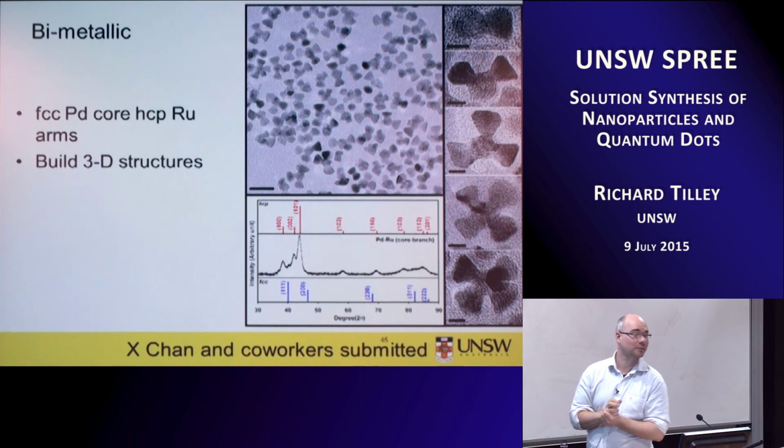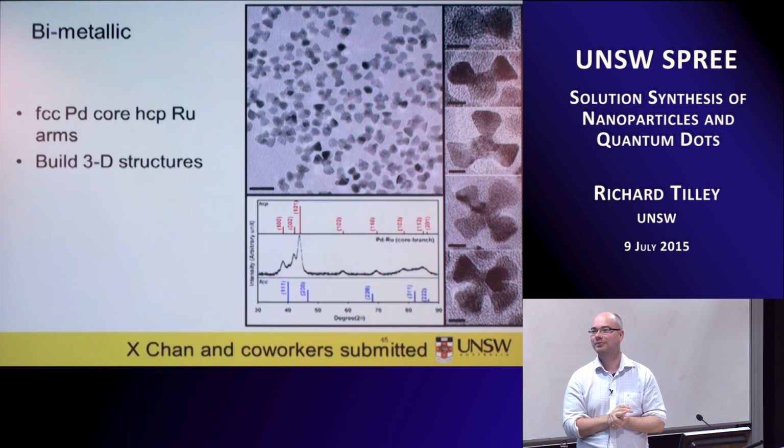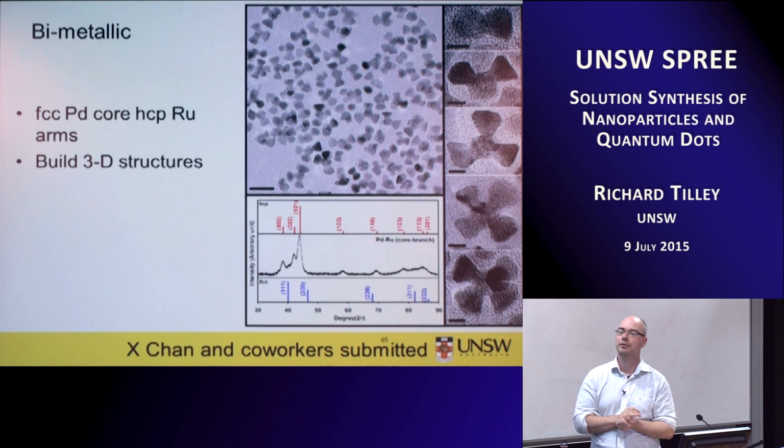Sorry, just a quick question. Maybe not the last two. Just following on the amount of surfactant use as well. Because I saw you using the lithium aluminum hydride to reduce the silicon chloride. In that case, what's your experience on protecting your surfactant, because lithium aluminum hydride is a strong reducing agent, would you consider the case that some of your surfactant actually will be reacted with the lithium aluminum hydride?